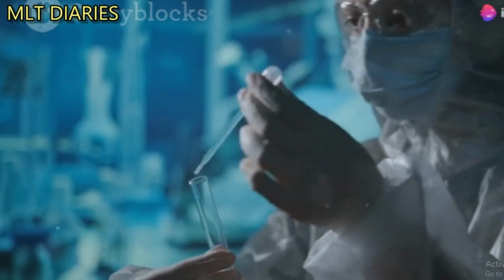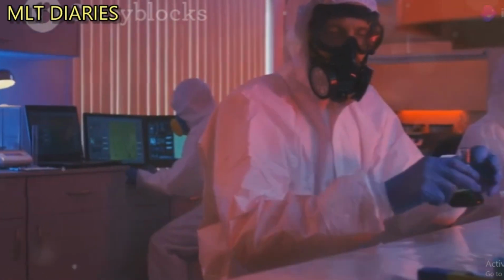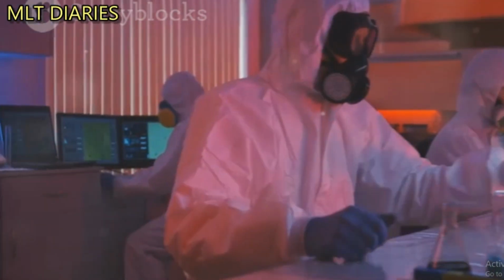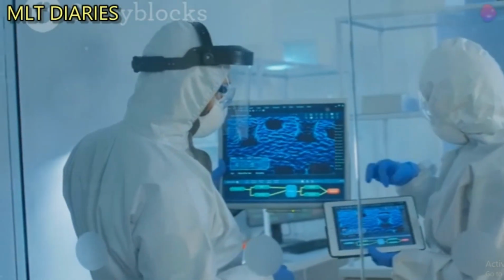Moving on, follow standard operating procedures, or SOPs. Use them as detailed in the manual for handling, storage, and disposal of biological agents. Ensure everyone in the lab is trained in these SOPs.